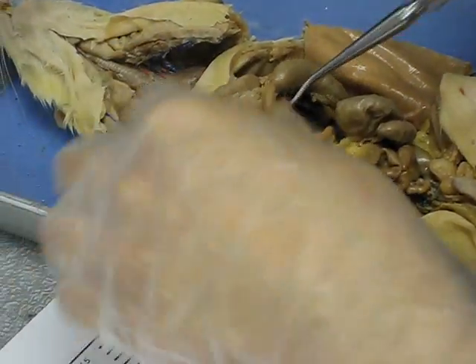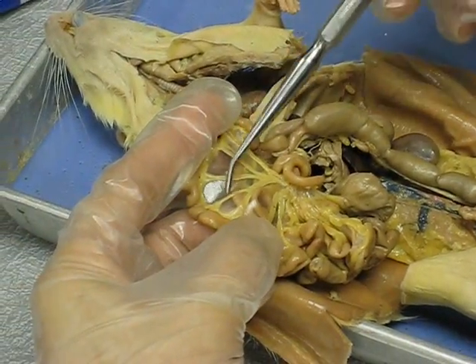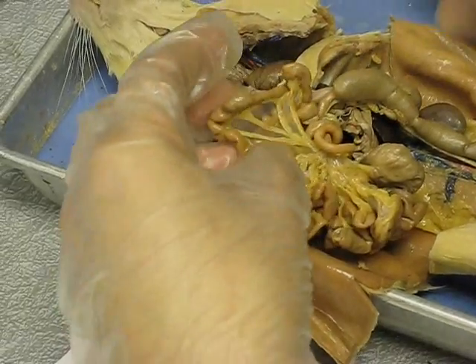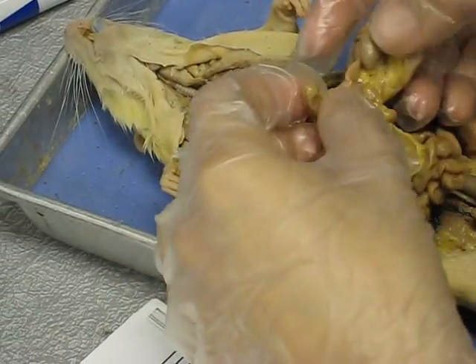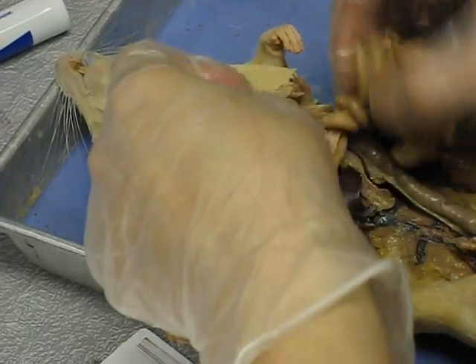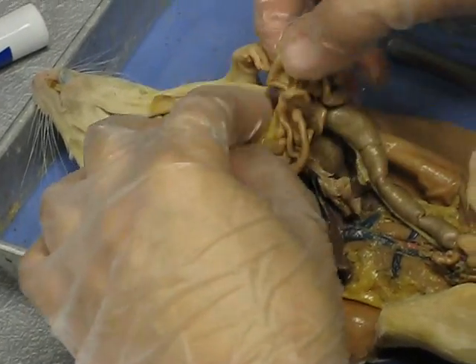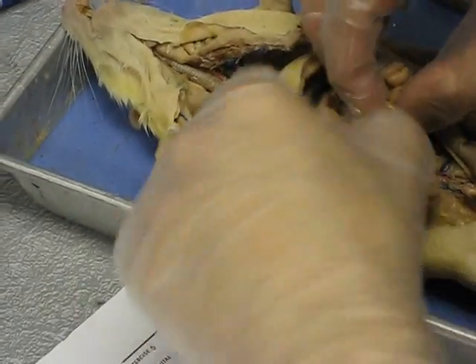Then we travel along — here we have the duodenum, and then small intestine, small intestine. These structures connecting the small intestine together are called the mesenteries — they hold everything together. You can see there are some vessels here: the intestinal arteries and veins. Then we have this other thing that a lot of people thought was the stomach — this is the cecum.